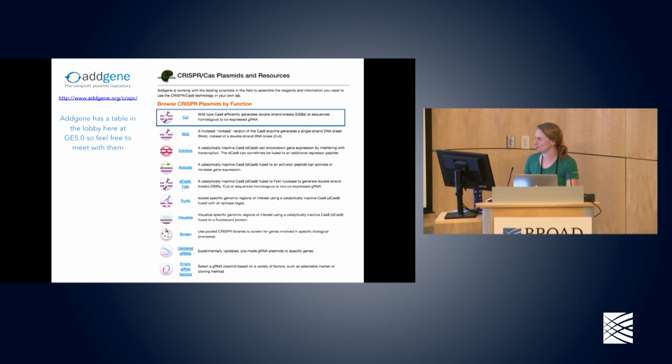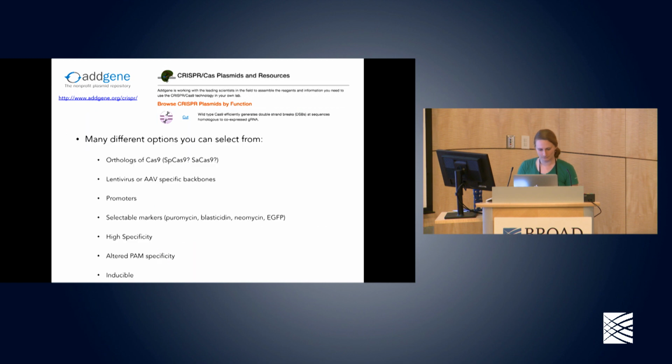But for the sake of this basics talk, I'm going to focus solely on cutting CRISPR-Cas tools. So if you're looking to cut the DNA, even with this one particular application of CRISPR-Cas tools, there are many different options that you can choose from.